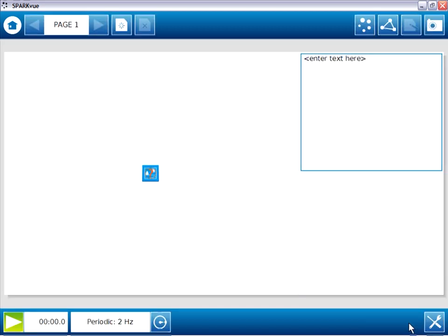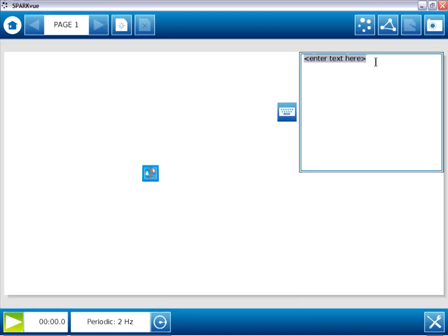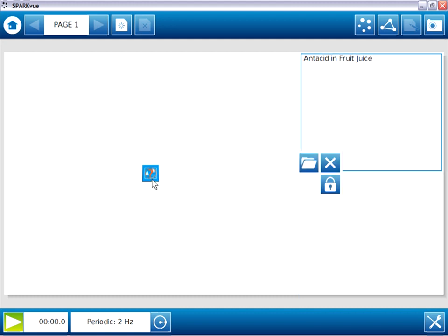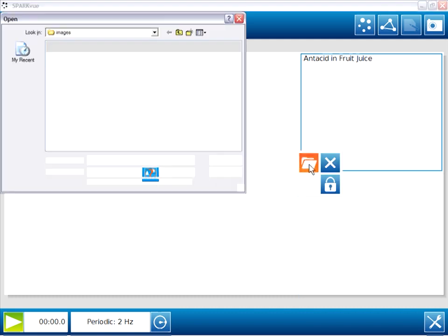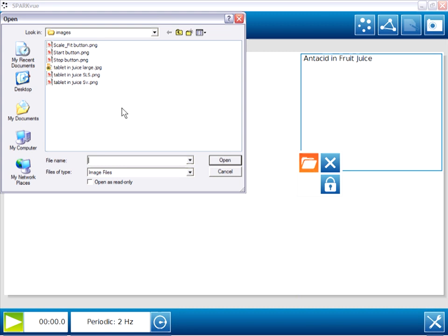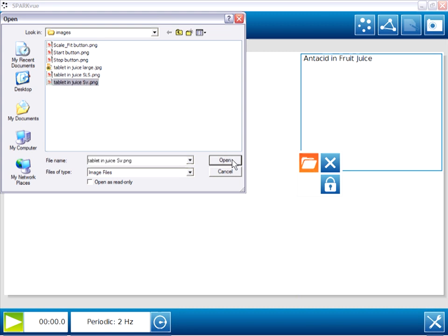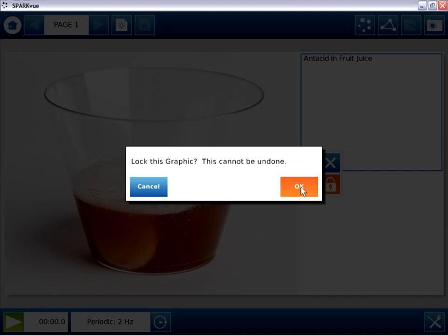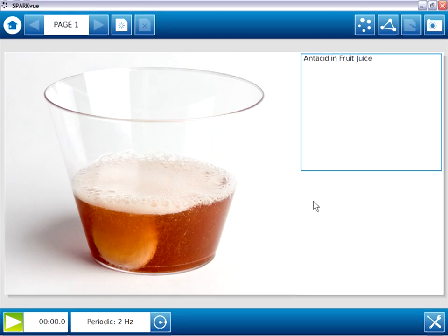This page looks good, so I'll press OK to build it, and it looks like we got the page we're looking for. I'm going to quickly type in the title of our lab here, and I'm going to fill this image element with the actual image I'd like. So I'm going to click and open up my file navigator and select the image that I'd like to occupy that space. Once I'm confident that's the image I'd like, I can lock that. And we're done with page one.